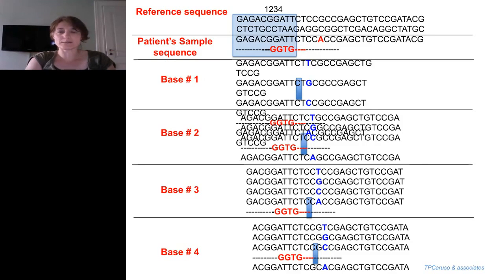Now, very important part is how actually does the resequencing work? Basically, all of the Affymetrix probes are 25 mers. And the way it works is that if you are going to sequence from this C here that I'm pointing with my arrow, you have to have the first 12 bases added to the sequence from your target gene, and those will not be ever read by the system because the algorithm requires the first 12 bases as a buffer, and it starts reading the very first is the 13th base, and the 13th base is the one that's variable, and you can have T, G, C, or A in that position.